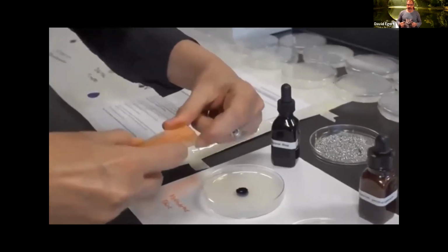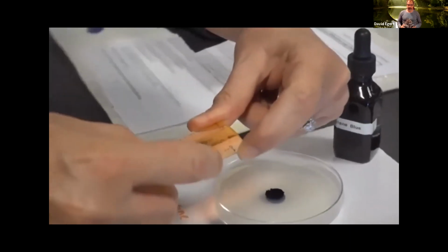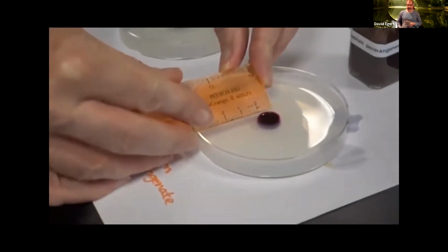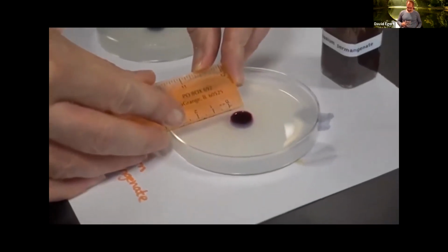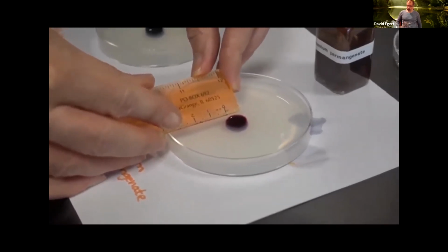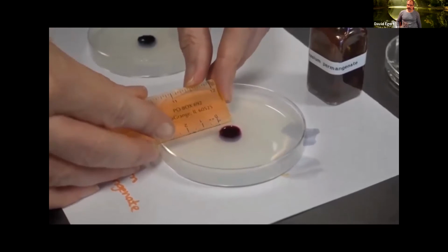So we're going to use millimeters or centimeters. And each time you want to measure from the edge of the well out to the edge of wherever the dye has diffused out to. So of course this is time 0 and it hasn't diffused at all. So our distance is going to be 0, and then we'll come back in a half hour.